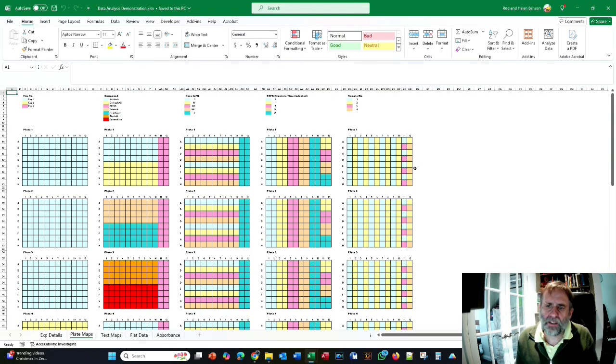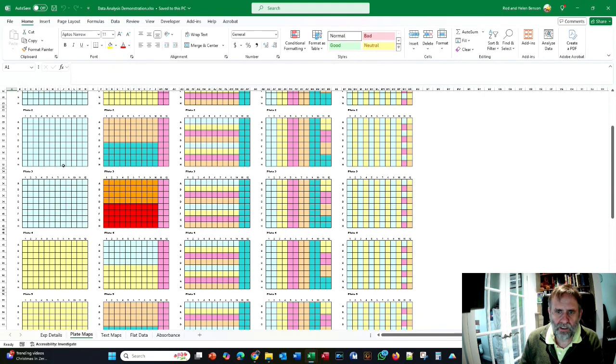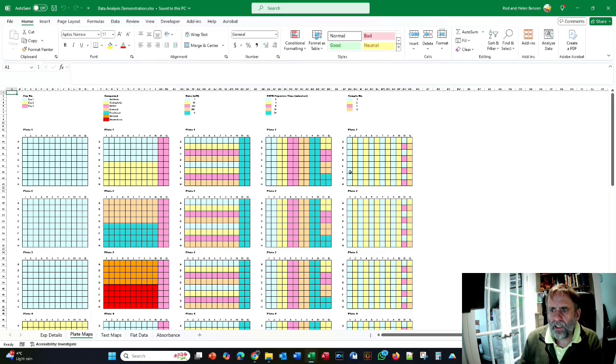And this particular experiment is a simple time course experiment. So the way this works is there are 3 different experiments. You can see here, so it's been done 3 times. In each experiment, we had some cells. In fact, they were, I think, MCF7 cells, and they were stimulated with epidermal growth factor. And you can see that we did a time course going from 0 to 30 minutes. So we end up with a time course.